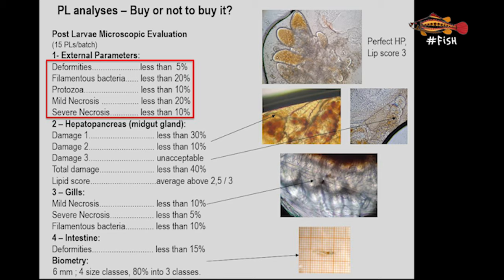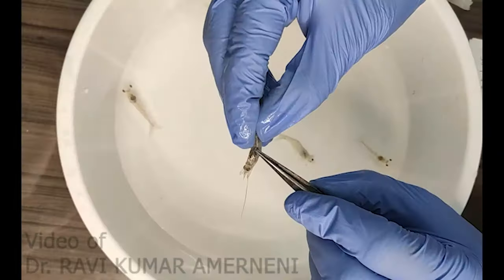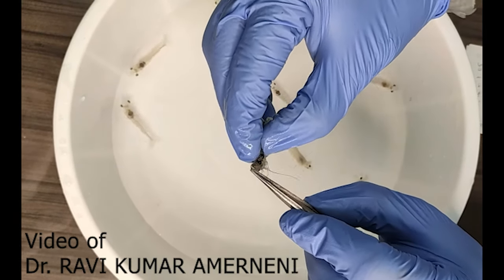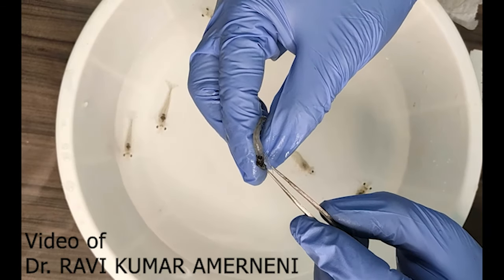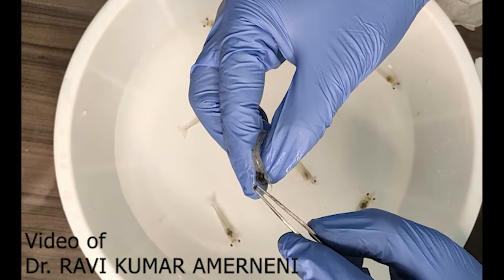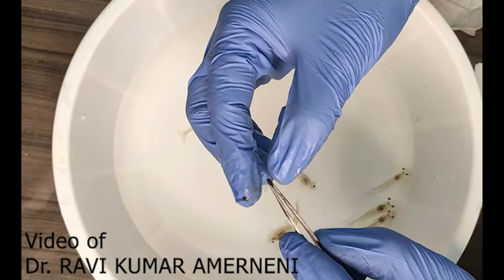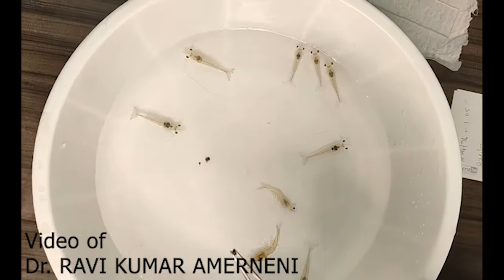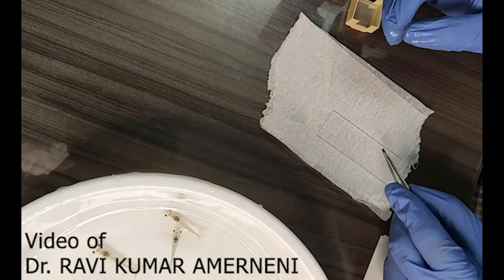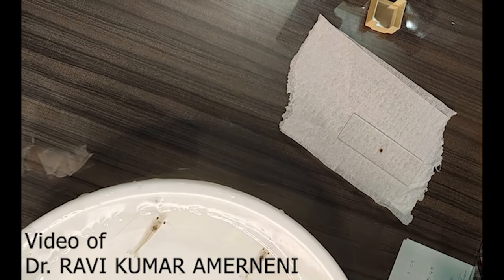As an example for Litopenaeus vannamei, less than 5% of animals should have external deformity, less than 20% should have mild necrosis, and no more than 10% should show signs of severe necrosis. Internally, what we should carefully assess is the health of the hepatopancreas. This is one of the most important organs in shrimp, as it is where the digestive process occurs, including absorption of nutrients and production of enzymes. Abnormalities in this organ can indicate that PLs are not healthy. We assess the level of deformity in hepatopancreas tubules, which normally have the shape of fingers, and the level of lipids or oil droplets in these organs, which indicates whether animals have been eating.